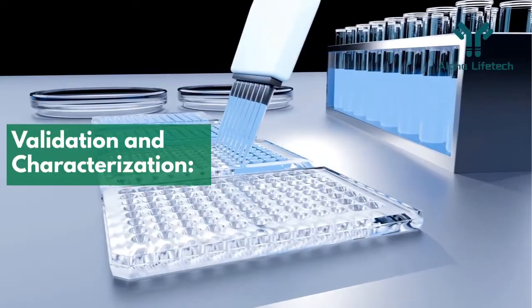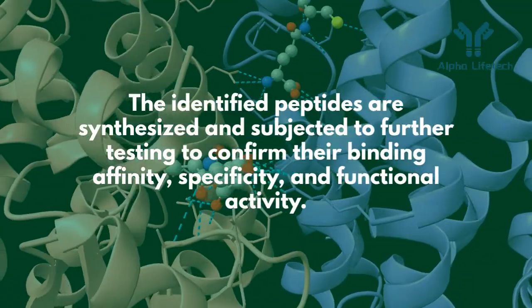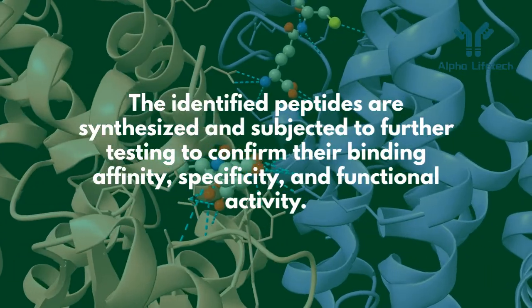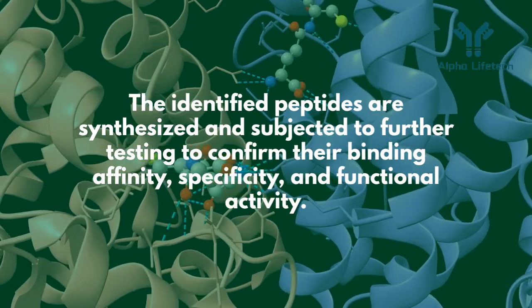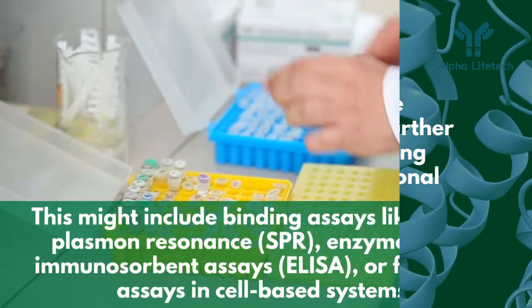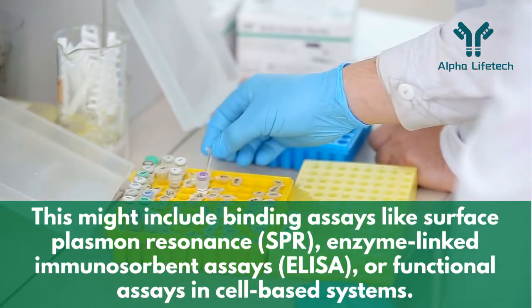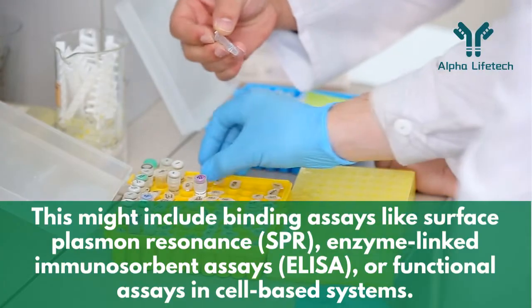Validation and characterization. The identified peptides are synthesized and subjected to further testing to confirm their binding affinity, specificity, and functional activity. This might include binding assays like surface plasmon resonance, SPR, enzyme-linked immunosorbent assays, ELISA, or functional assays in cell-based systems.